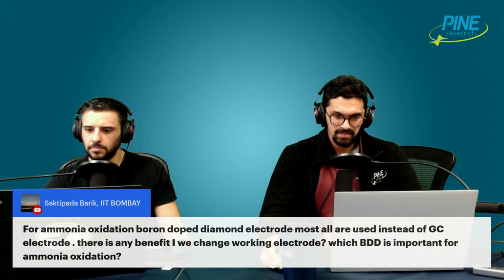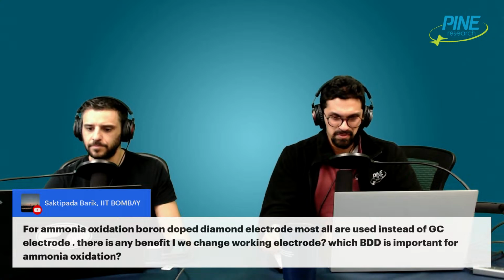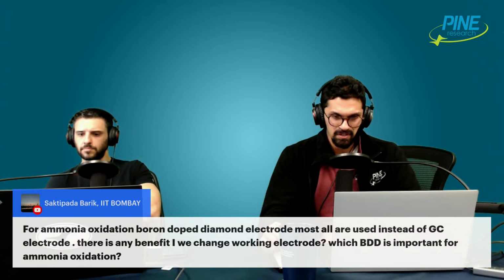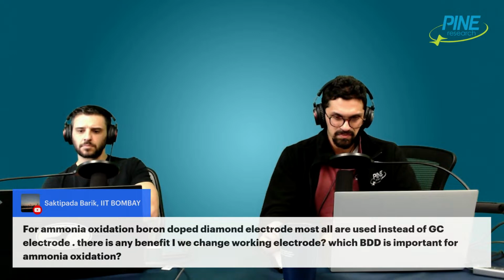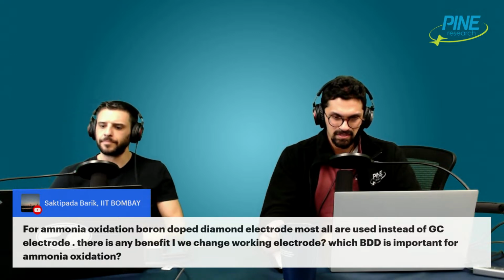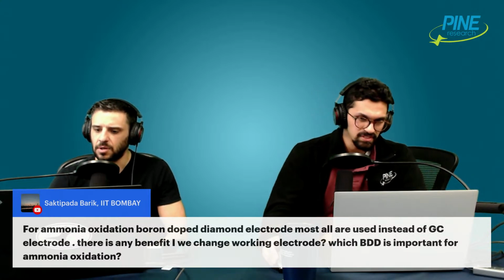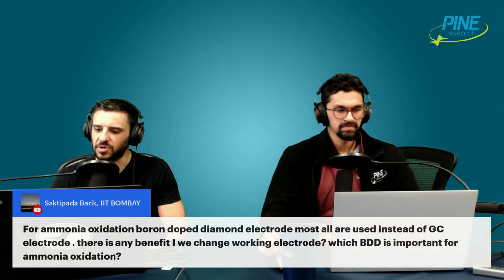So there's a question from Saktipada. Again, sorry for mispronunciation of names. For ammonia oxidation, boron doped diamond electrodes are used instead of GC electrode. I guess, is there any benefit if you change the working electrode? Why is BDD important for ammonia oxidation?